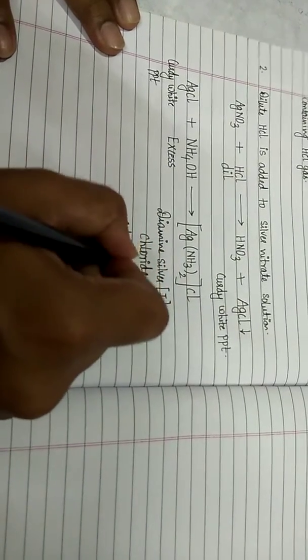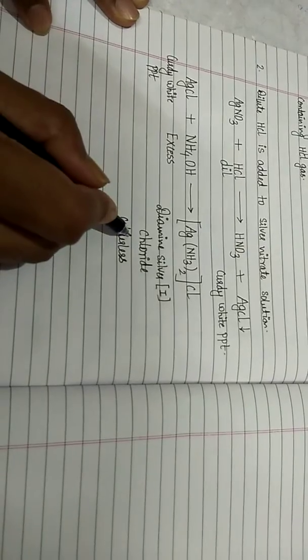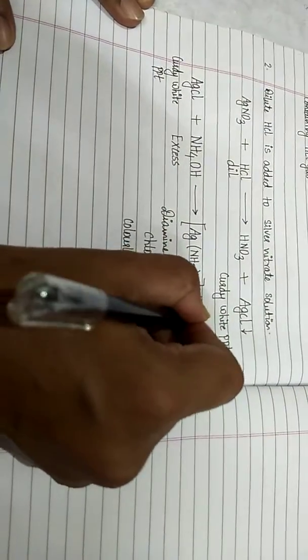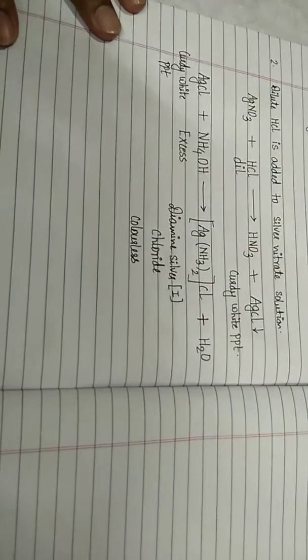So the color change is that the curdy white precipitate of silver chloride dissolves in excess of ammonium hydroxide to form a colorless solution of diamine silver 1 chloride plus water. We balance the equation first.